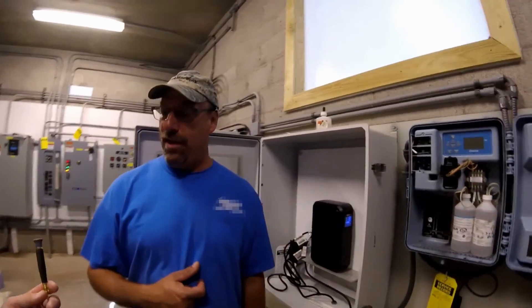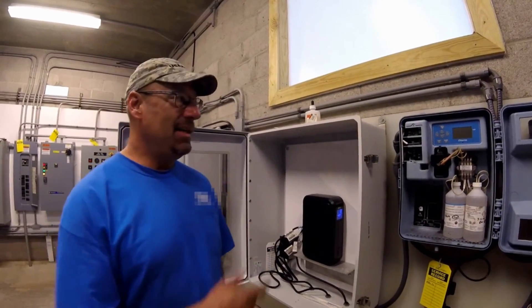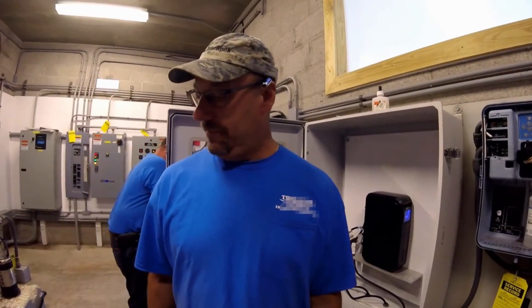Am I allowed to power this up with the cover off? No. All right, then you all have to put the cover on there. The cover is still on.